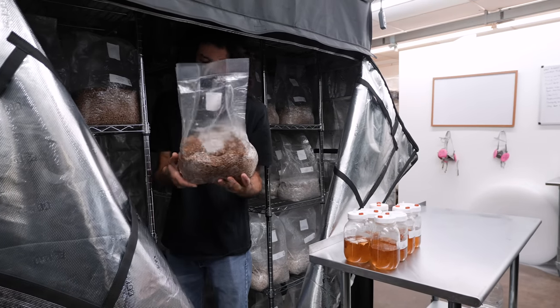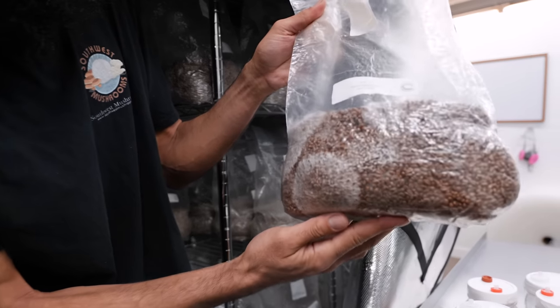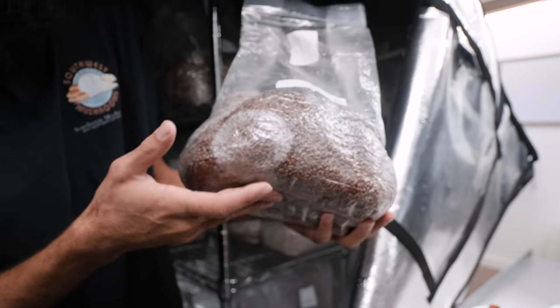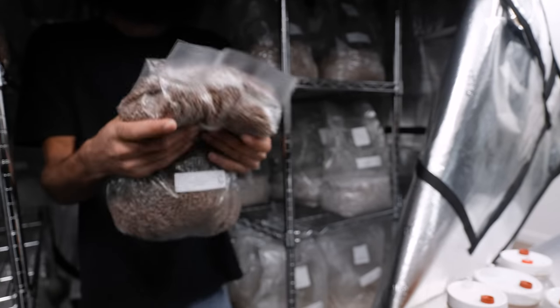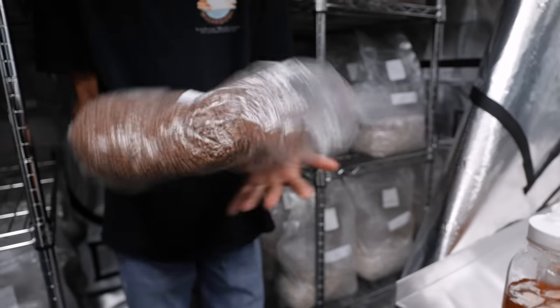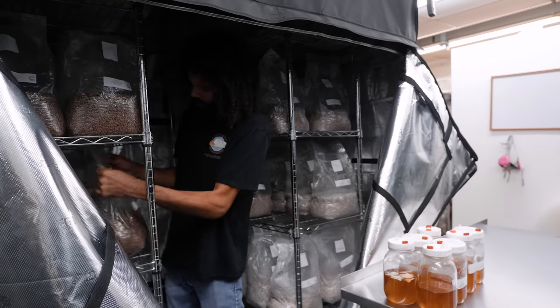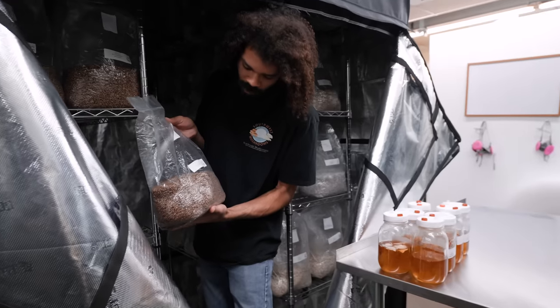Some of this spawn was inoculated about a week ago, and we can kind of see the mycelium starting to really take over the grains. At this point, it'd be a good idea to shake the bag or break up the mycelium pieces — the colonized pieces — to redistribute them throughout the bag. That way it'll really speed up colonization. We should see full colonization within the next few days.